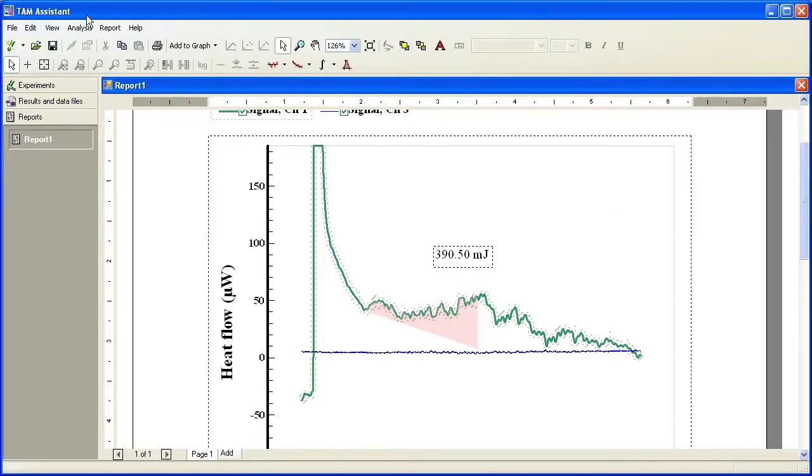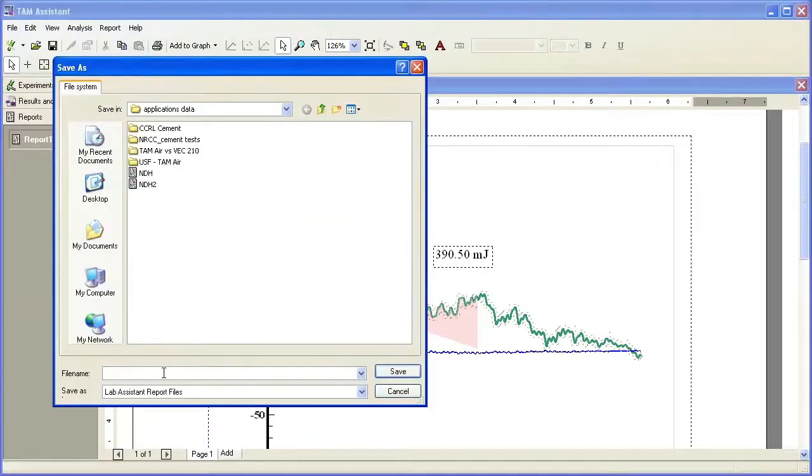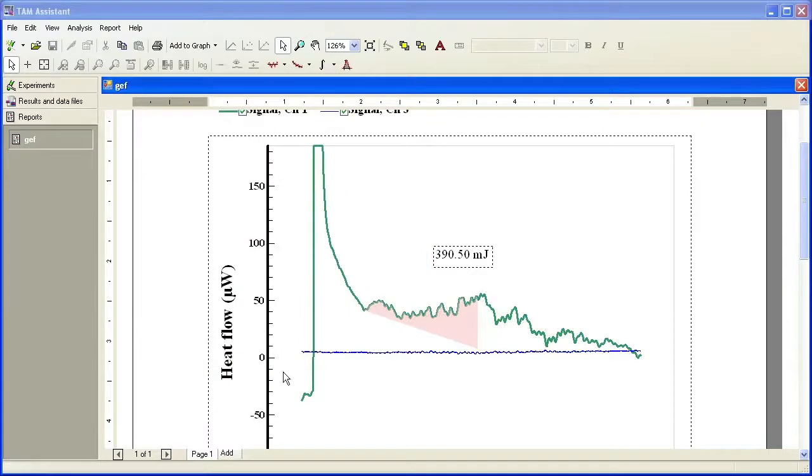If you like, you can also save this report file by going to save as report. And this report will then be saved so you can open it at a later date in TAM Assistant software.